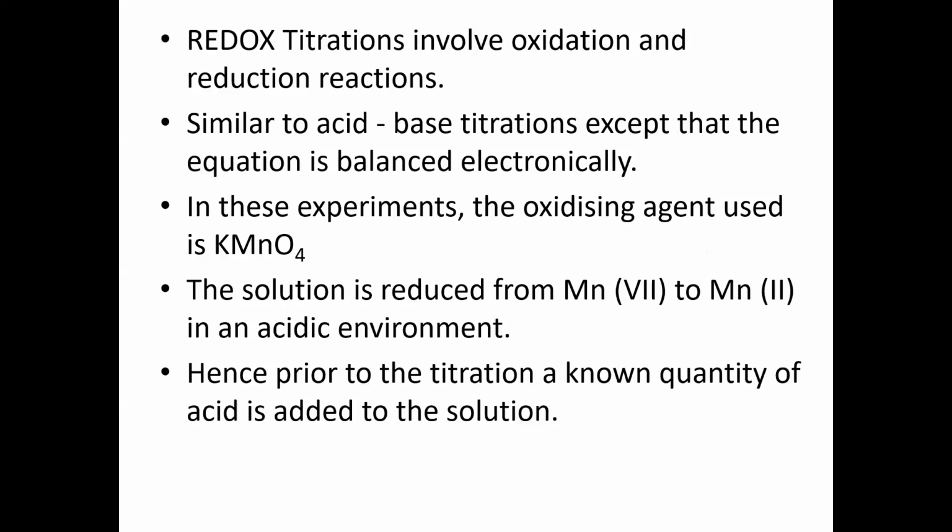This titration also is similar to acid-base titration. The same way you fill your burette and you run your content in your burette into the conical flask and you get your endpoints. But the difference now is that instead of balancing our equations like the acid-base, balancing the number of moles of your reactant, we balance the equation electronically.